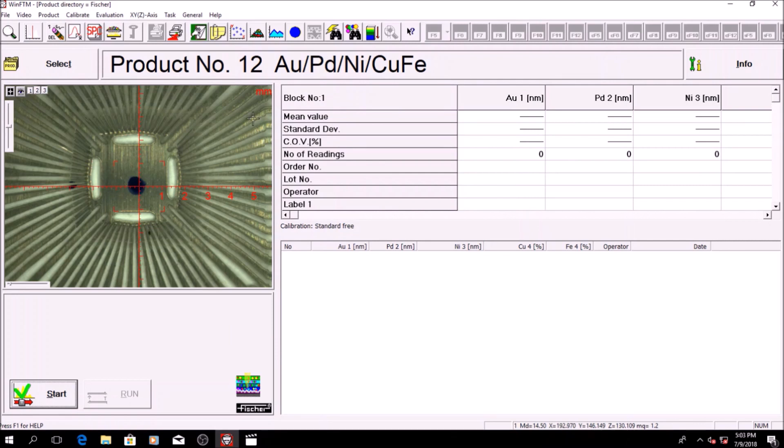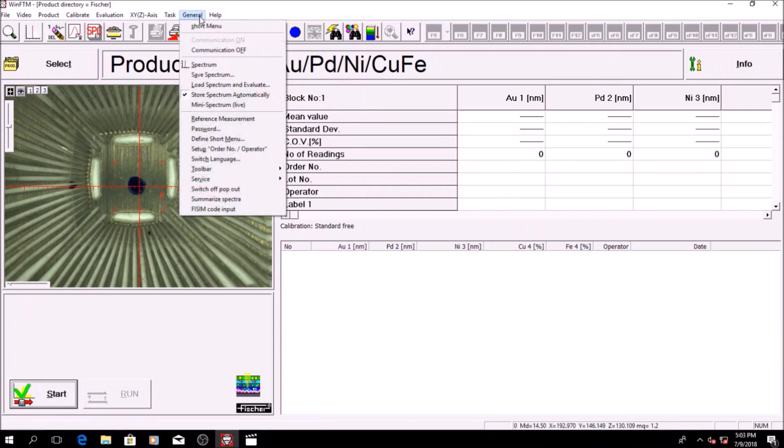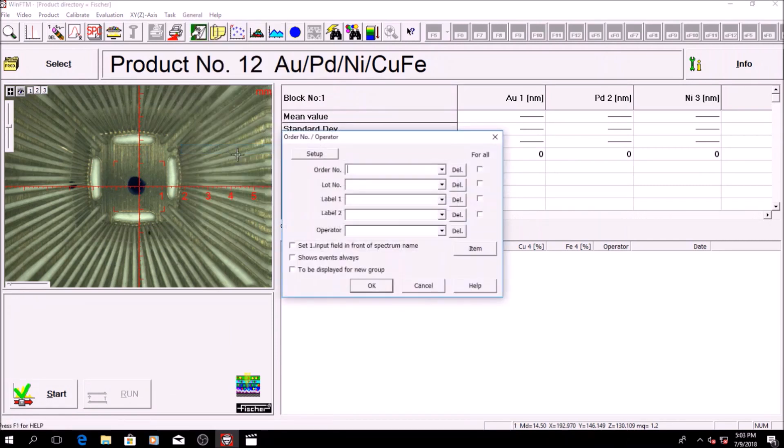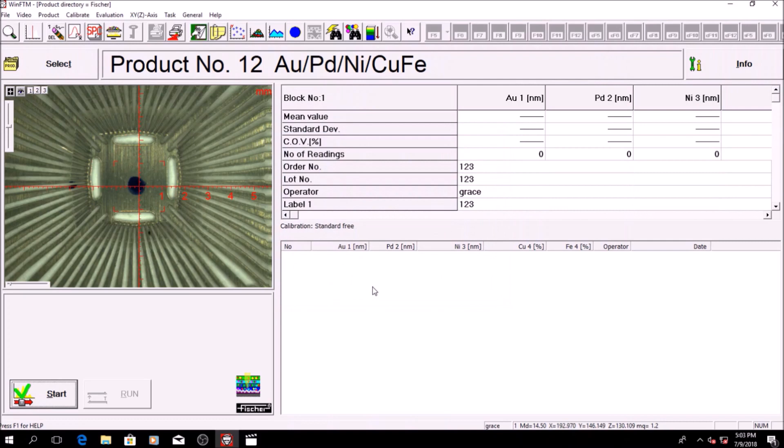click on general followed by setup order number/operator to fill in details such as order number, lot number, and operator name.